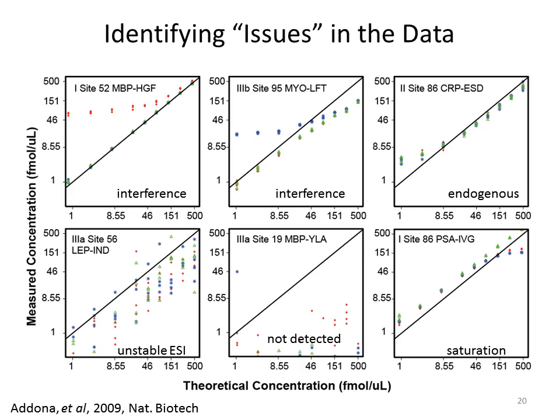I know the word is up there, but does anyone know what causes that? If you're running a calibration curve in a complex sample, this is actually because you're able to detect that analyte in your sample without spiking it in.